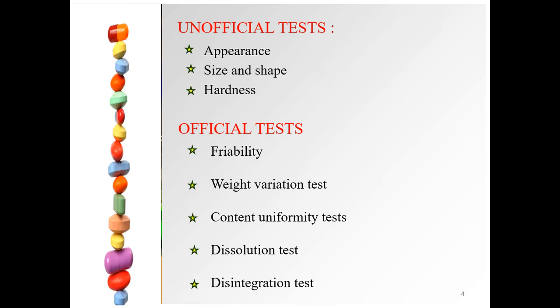Let's start a lecture on official and unofficial tests. As we know, there are two kinds of tests usually performed in the quality control department. One is the official test, the second one is the non-official or unofficial test.